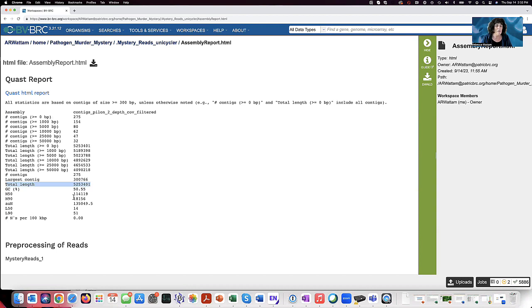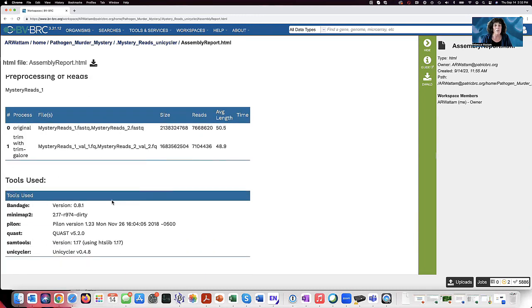There are some other things that they use to estimate quality of the genome, but those are kind of archaic. If you really want to know what those things mean, go ahead and email me. I actually have some slides because I thought if I have to learn it, you guys have to learn it. And then this morning I relented and said, you know what? It's so old and nobody really talks about it that much. So I'm not going to make these guys do it, but we could do it if you wanted to. And then it says that it trimmed the reads, and there you go.